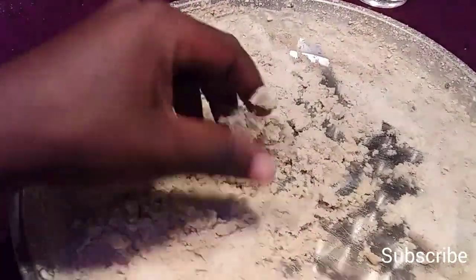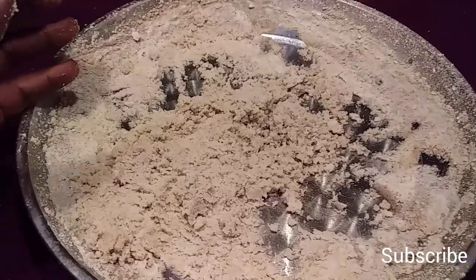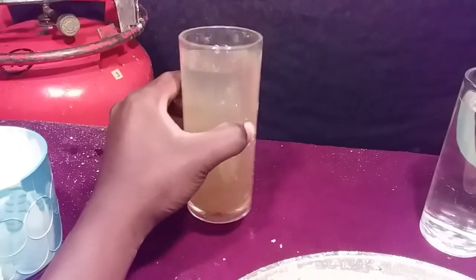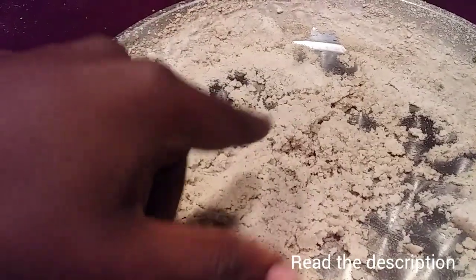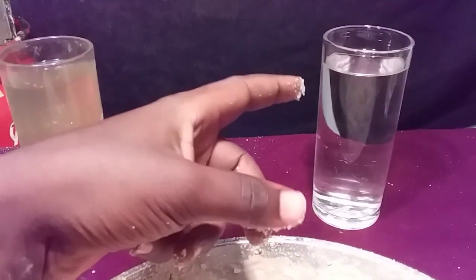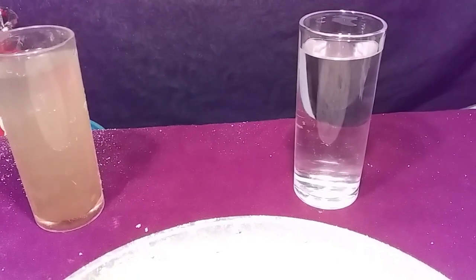The reason you see this brown color in the salt is that the water I used for the evaporation process was not very clean. I used water that was already looking impure. That's why you see this color on the salt. But if you can find a way to filter all of the water so that it is very pure, then you will be able to have very clean, white salt at the end.